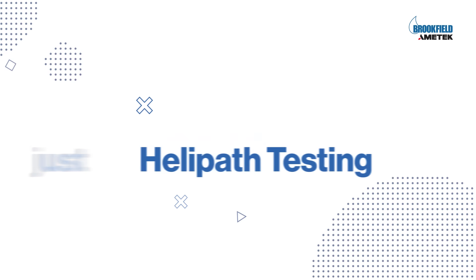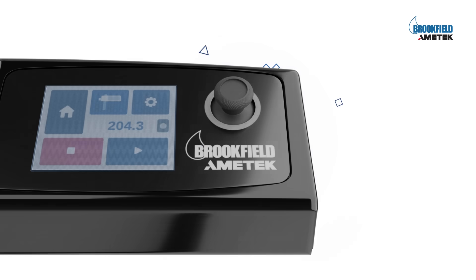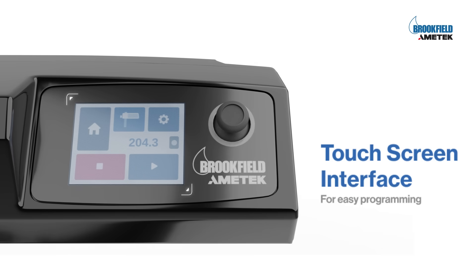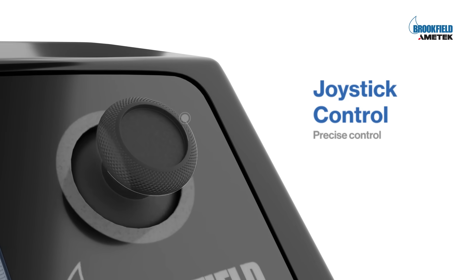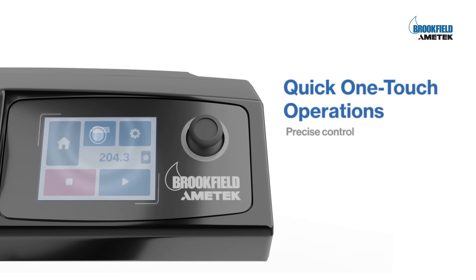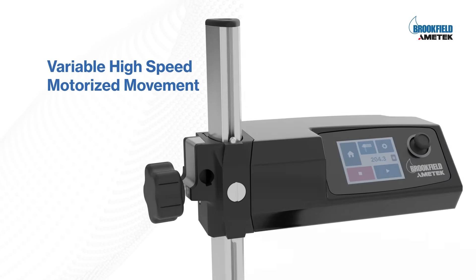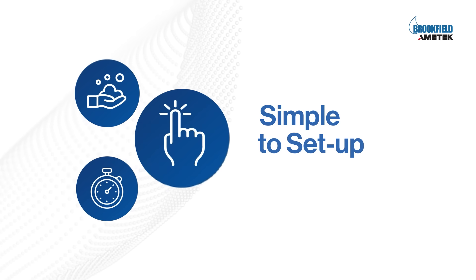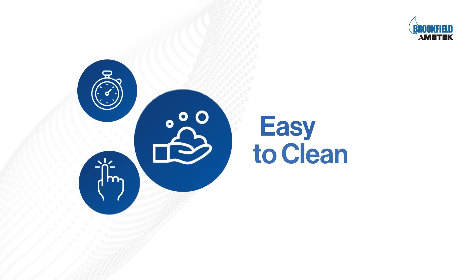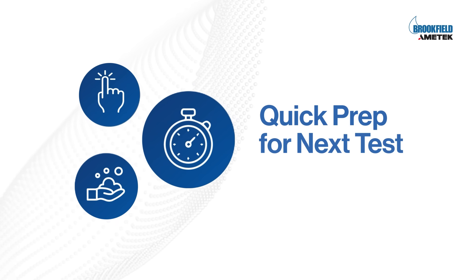This premium viscometer stand is for more than just helipath testing. Additional features include a touchscreen user interface for easy programming, joystick for precise control, quick one-touch commands, variable high-speed motorized movement, simple to set up, easy to clean, and quick prep for the next test.